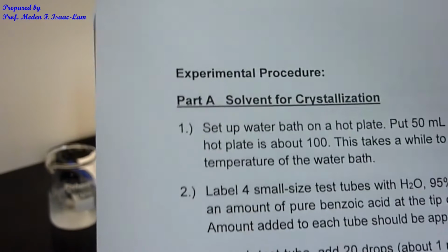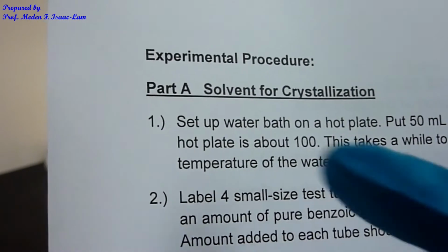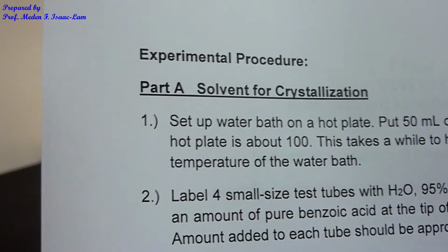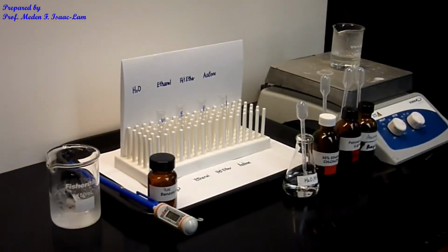So I'm going to do first part A, which is choosing the right solvent for recrystallization or crystallization of benzoic acid. Now I already have the setup.